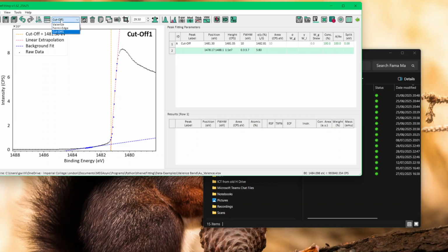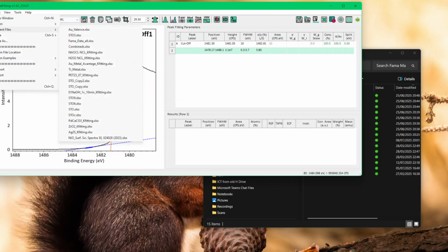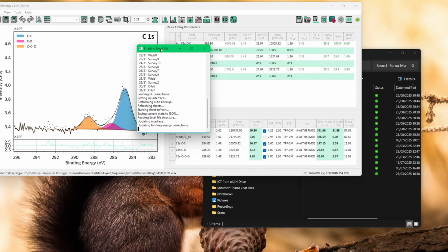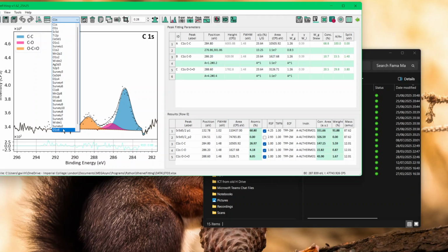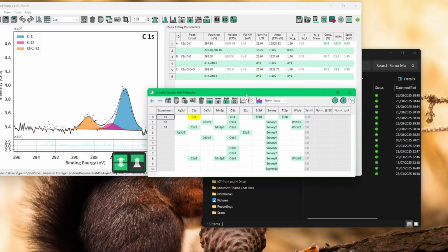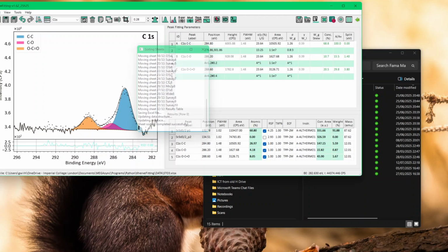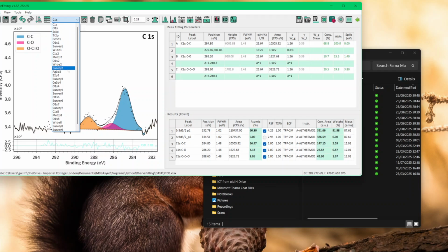option to sort pages. For example, if you go into the STO3, you may look at your files, and it may be a mess. For example, you can see the O1s and the survey 2 are all not at the right location of your page. And if you look at this here, that's all fine. But when you copy, then it all becomes a mess. So you can use this organization here to redo everything. And now this should be organized properly.